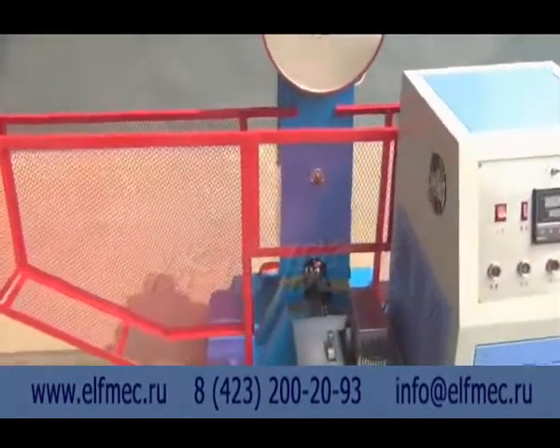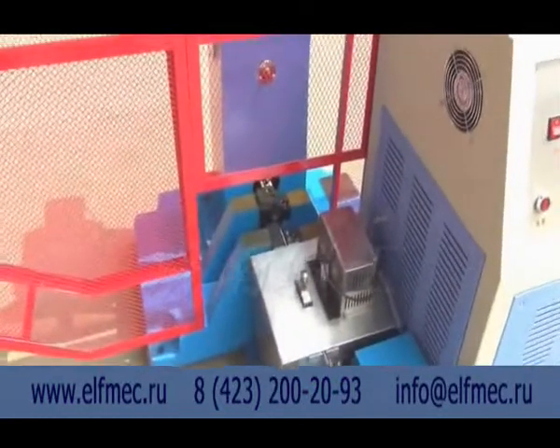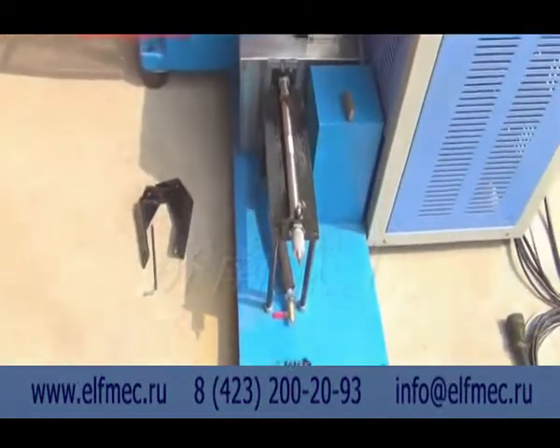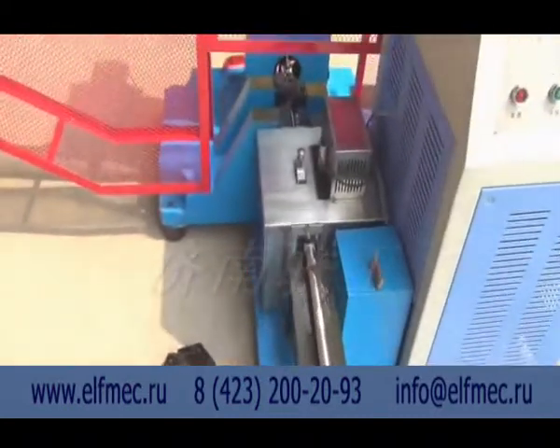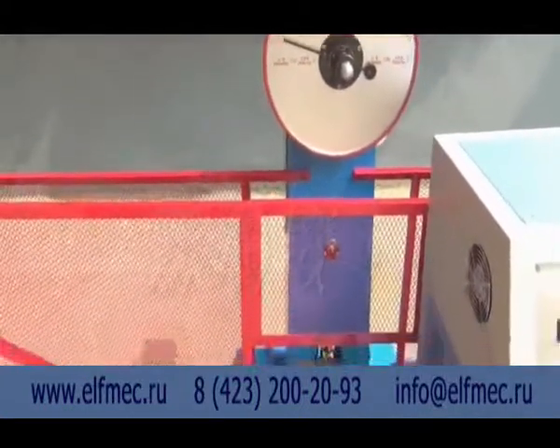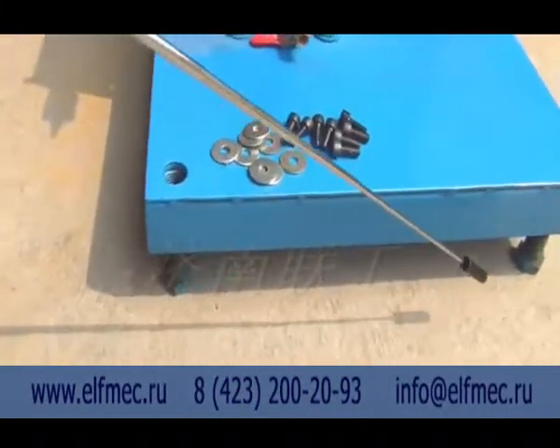The host bottom of the automatic impact testing machine should be higher than that of the automatic feeding device. The purpose is to make the host front jaw bearing position and the automatic feeding specimen outlet position as the opposition picture shows. For height difference requirements, please refer to the test picture of the host opposition instruction.